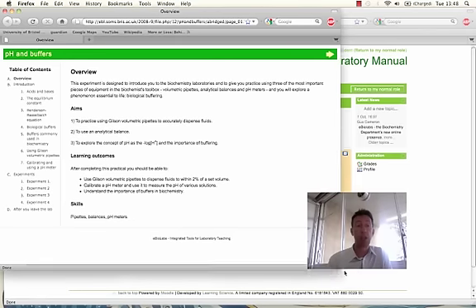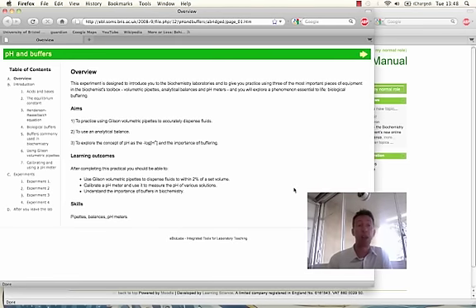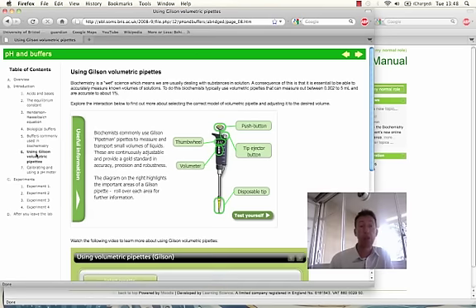So this information here, this content, was created by academics in Word and then converted into web pages using CourseGenie. In a parallel project, we've created multimedia resources to help really explain to the students what they will be doing in the lab.